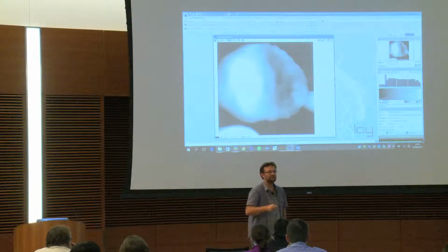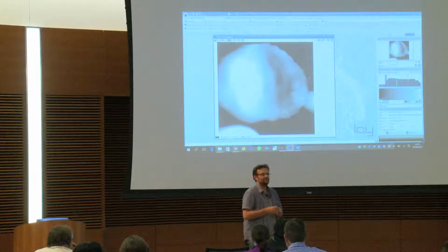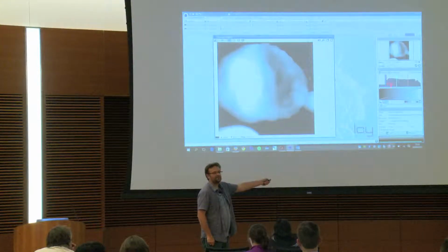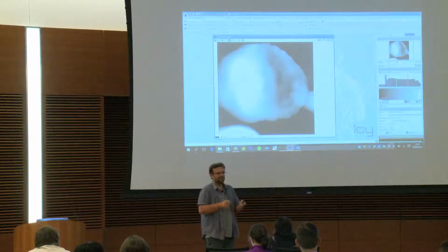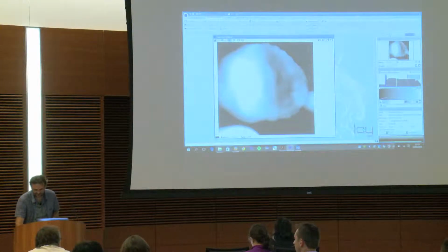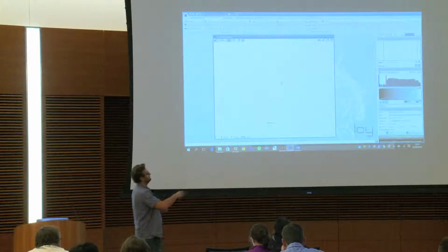So my question is, what is below the background? Because there is something here. So is it the basement of the image or something? How would you do to see where this data is located? Come on, don't be shy. It's always an easy question. So you just take this boundary, you put it here, and this one, you put it here. And you see nothing. You unzoom a little bit, and here it is. It is this thing here, okay?